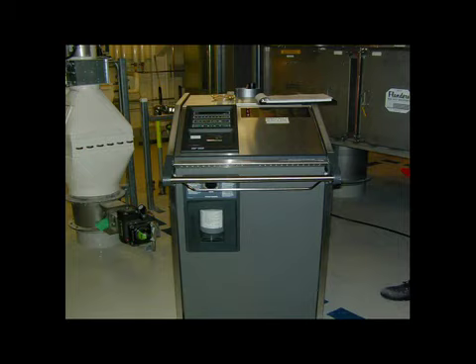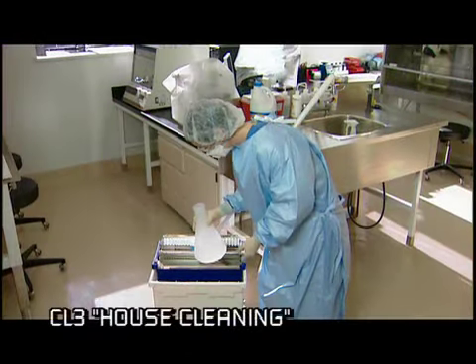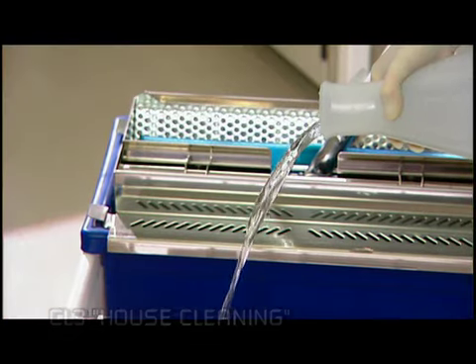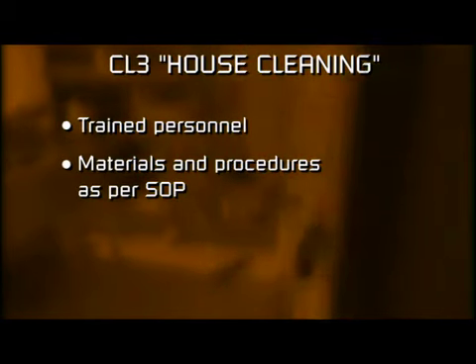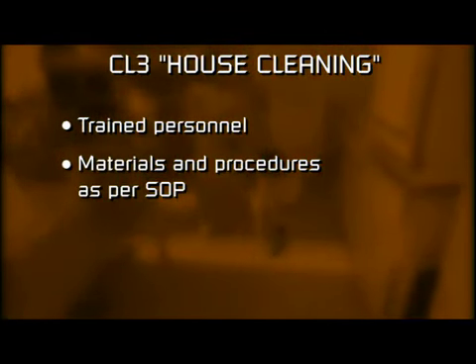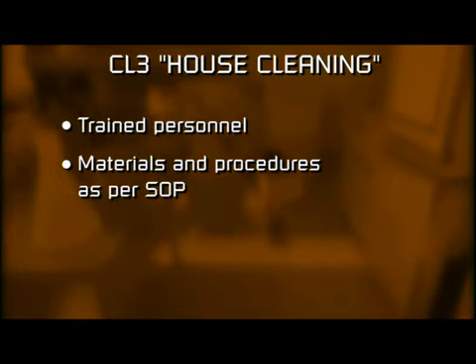As in any lab, there are also regular housecleaning chores that need to be done, cleaning floors, walls, and disposing of waste. But because of all the precautions in a Containment Level 3 lab, they have to be done by trained personnel using specific procedures and materials while disposing of waste in accordance with the facility's SOPs.